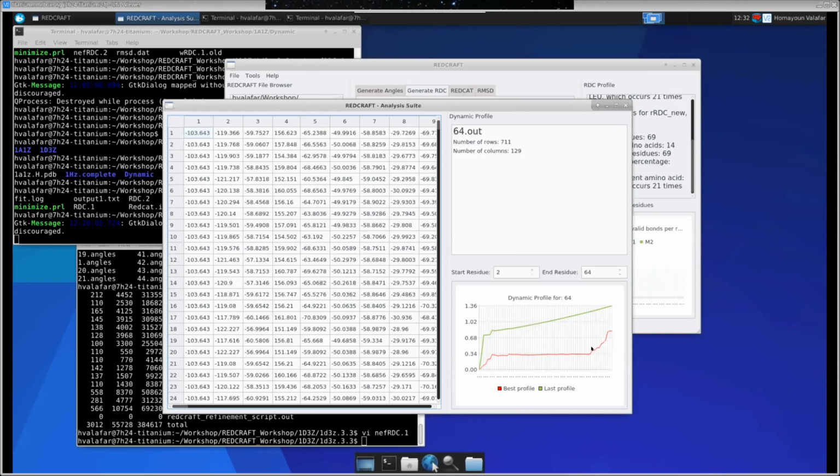So the violation that's being observed here is that either Ramachandran space was too constrained, or my assumptions about the rigidity of the peptide plane are violated, or it is dynamic. The first one, whether it's a localized constrained Ramachandran, or whether my cis-trans amino acid, would appear as a blip followed by a return back to the plateau behavior.